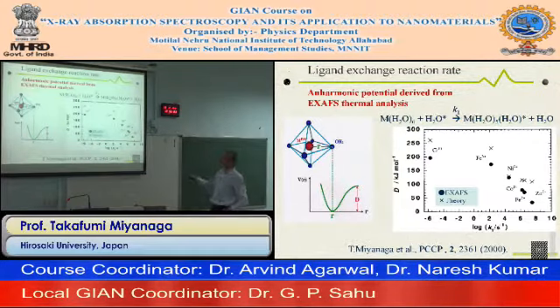So why such widely different exchange rates? From our EXAFS analysis, we measured and analyzed the d values. The d is plotted from the experiments here, and this is the exchange reaction rate here. So there is a very nice relation.